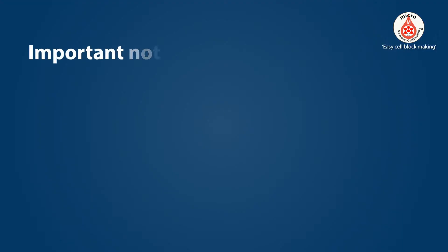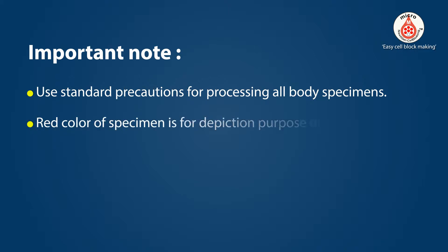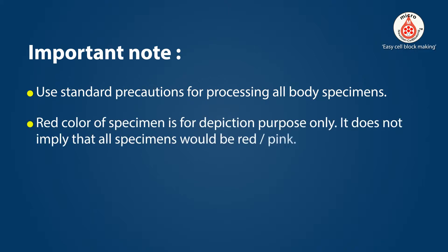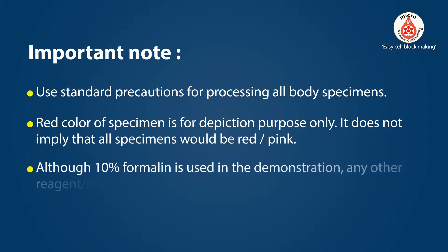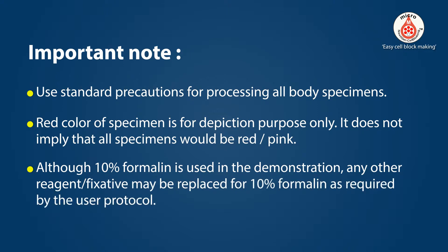Important note: use standard precautions for processing all body specimens. The red color of the specimen is for depiction purposes only — it does not imply that all specimens would be red or pink. Although 10% formalin is used in the demonstration, any other reagent or fixative may be substituted for 10% formalin as required by the user protocol.